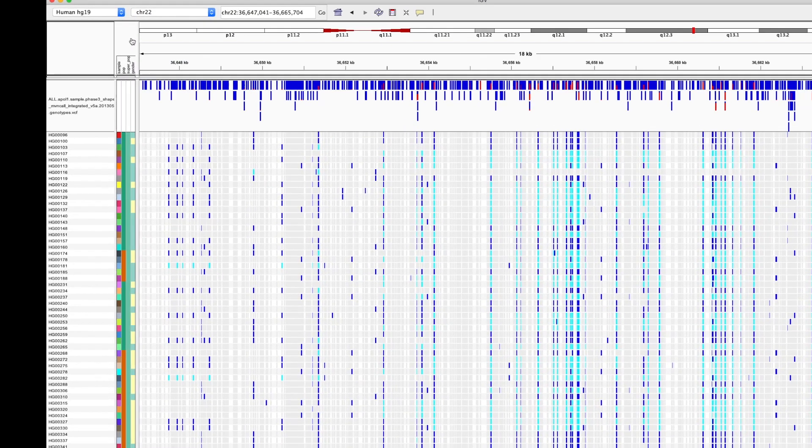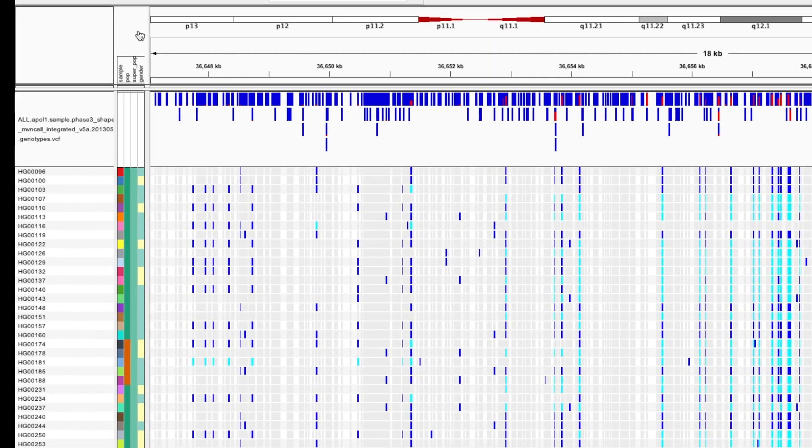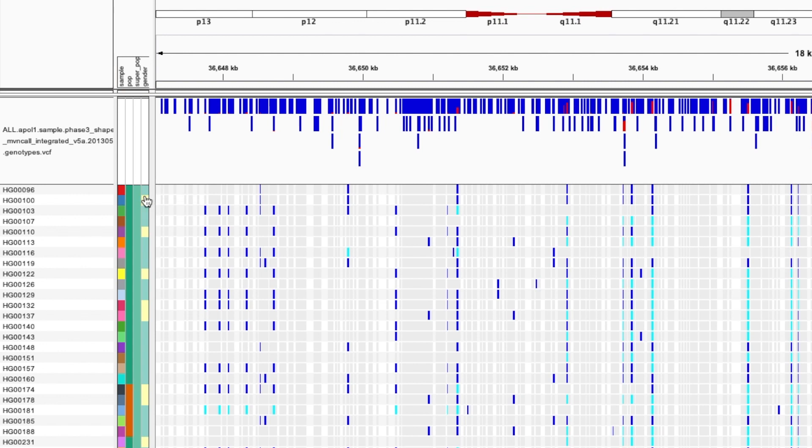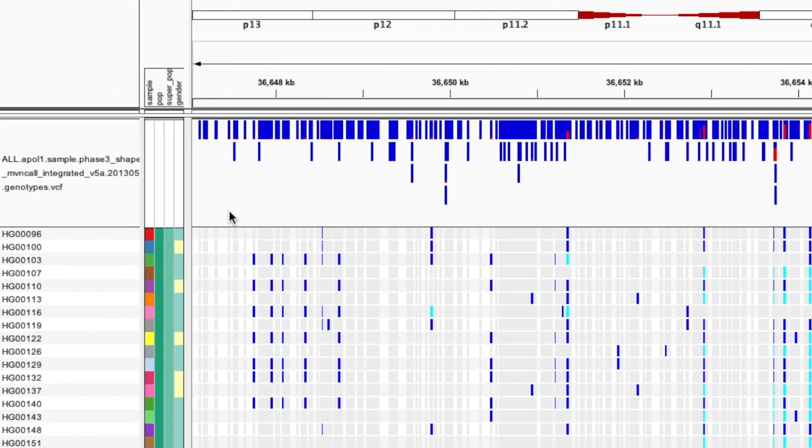Awesome. Now we can see the population, superpopulation and gender of all of our samples. If we hover over the annotations, we can see the values the colors correspond to.